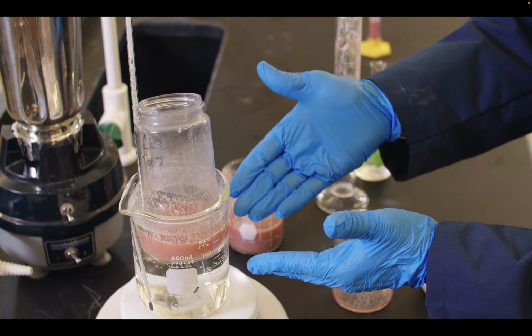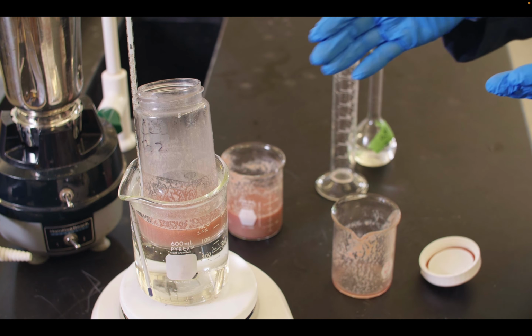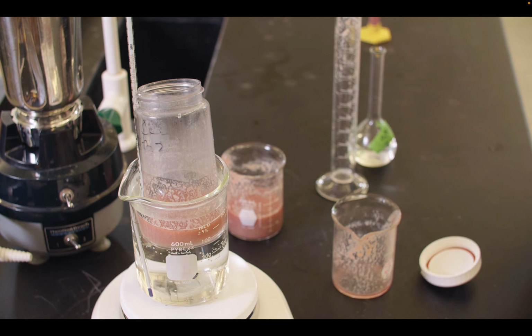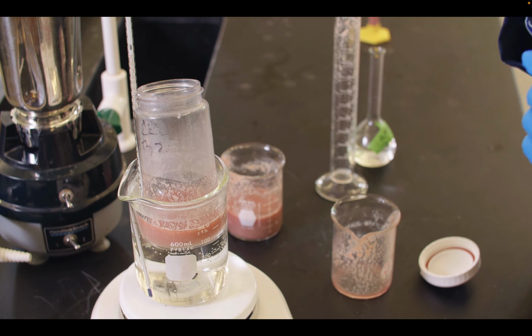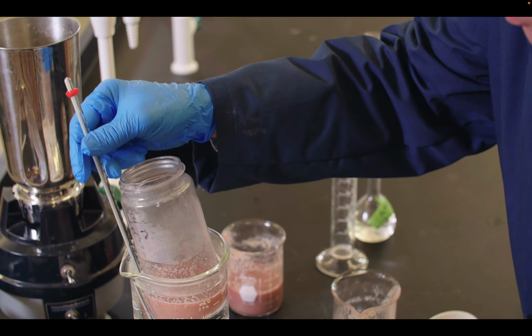However, we're hoping that many of the enzymes in here that are heat sensitive will actually denature, and they'll precipitate out to the bottom of this flask. If they do so, then that will effectively separate them from our glutamate oxaloacetate transaminase enzyme that we're actually aiming for. That's the thing in the pig heart that we want. All right, so we're going to heat this for 20 minutes. It looks like we have it right at about 72 degrees, and we don't want to go above 72 degrees, so that is great.